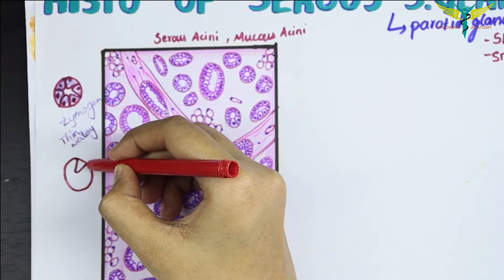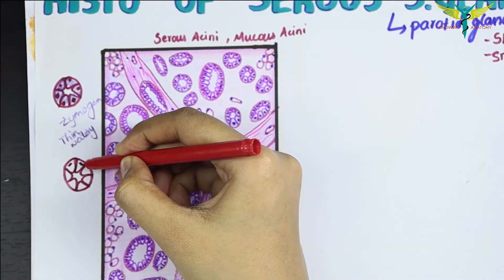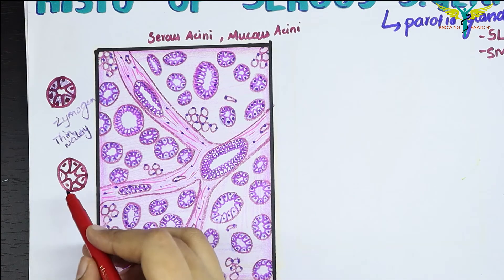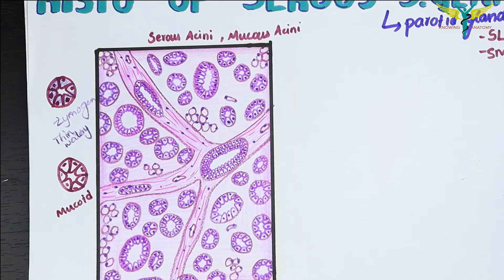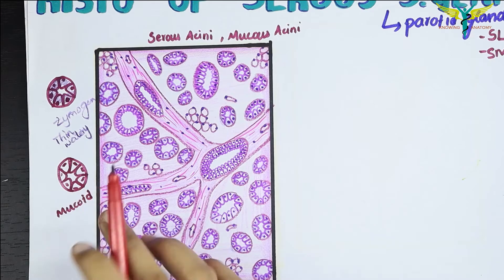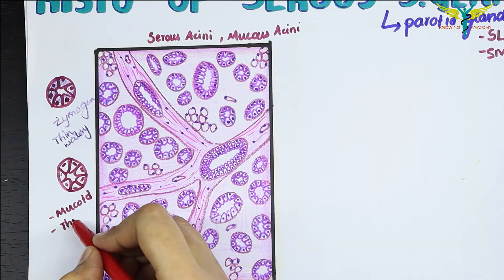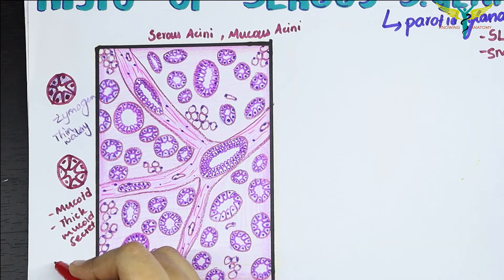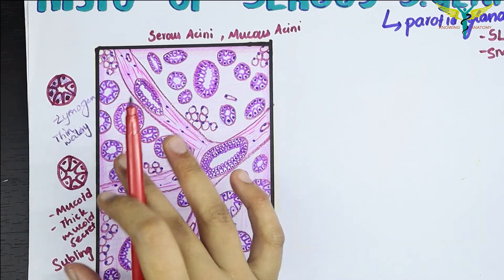Serous acini secrete thin watery secretions. The mucous acini contain cells with a flat nucleus that also lies at the base. Their cell boundaries are distinct. These mucous acini contain mucoid material, appear lightly stained and empty in hematoxylin and eosin stain, and secrete thick mucoid secretion. Many mucous acini are found in the sublingual gland.